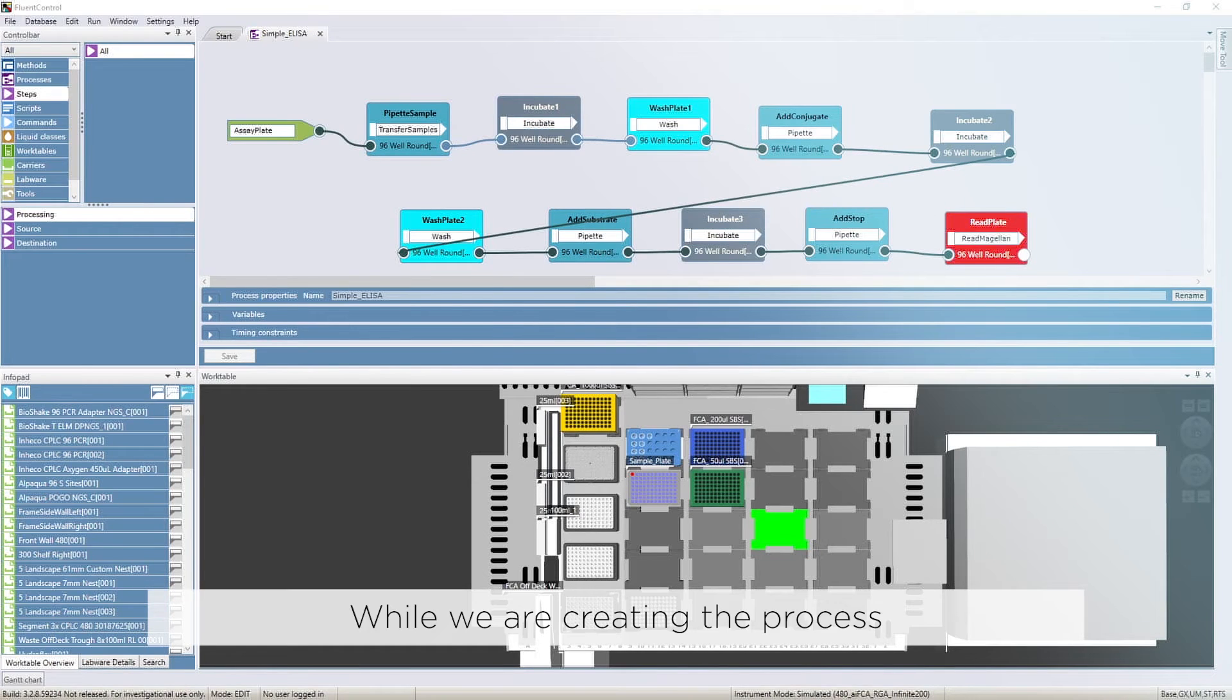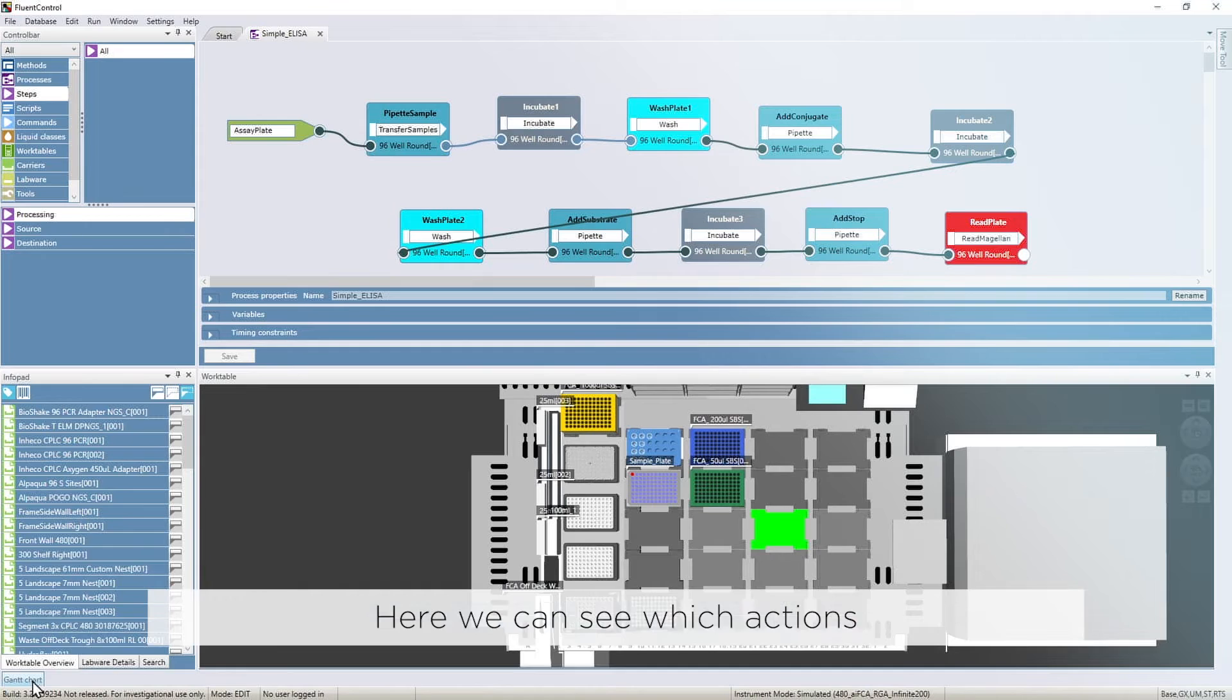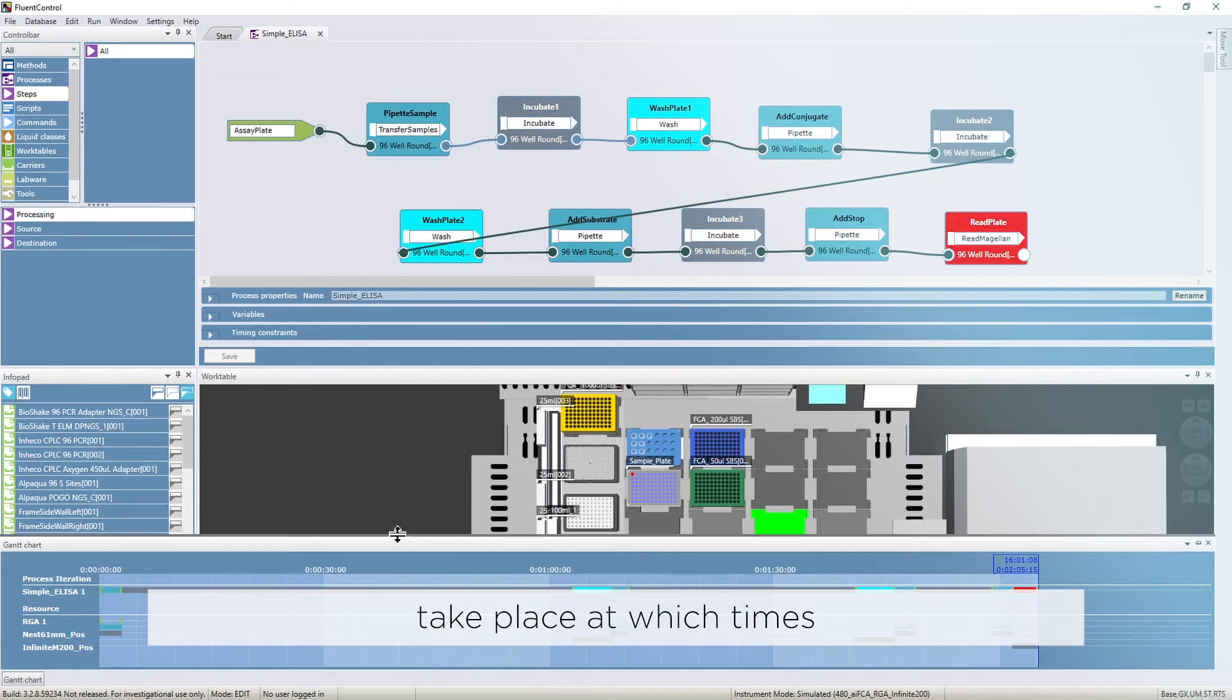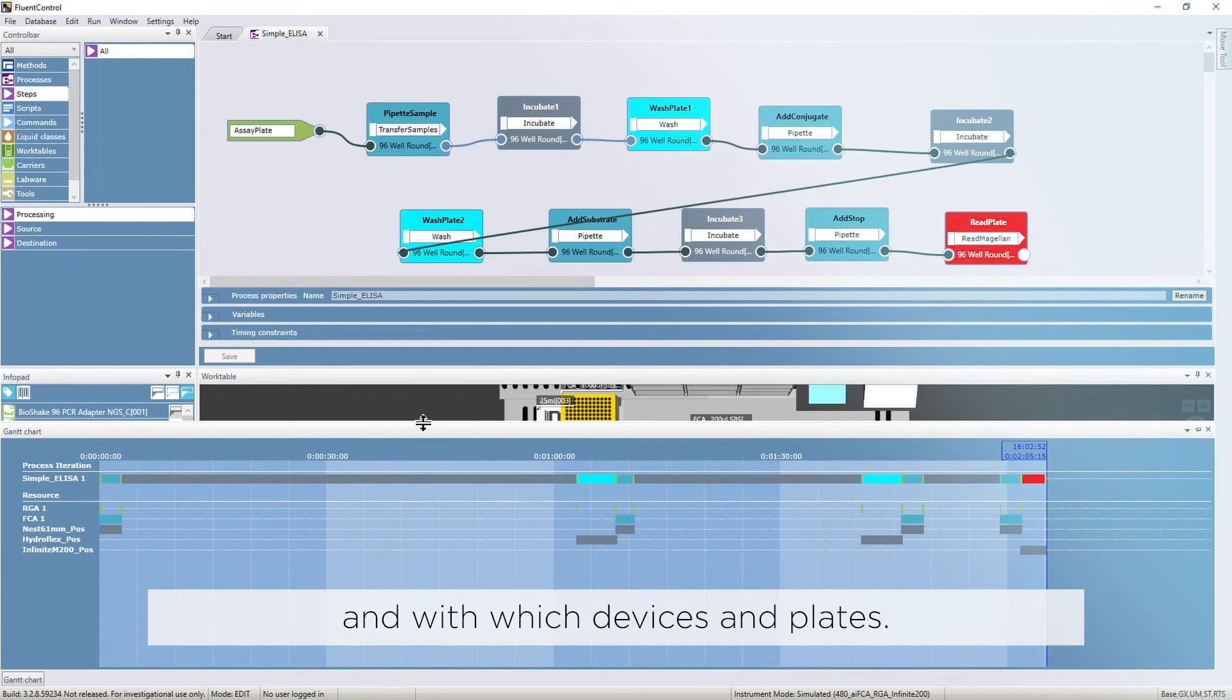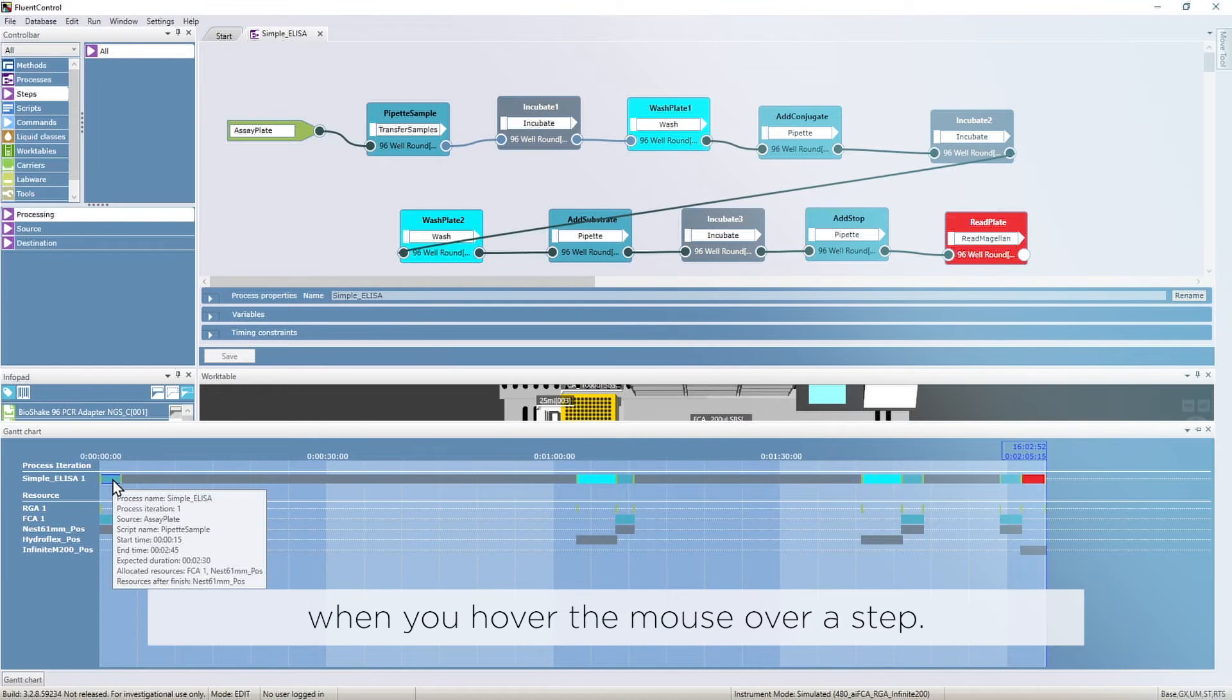While we are creating the process, FluentControl shows a Gantt chart. Here we can see which actions take place at which times and with which devices and plates. You get extended info when you hover the mouse over a step.